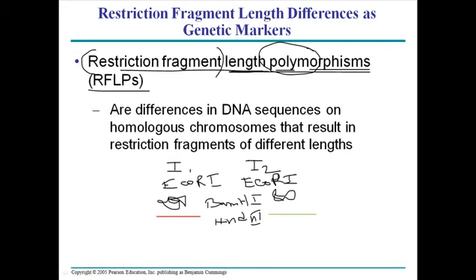After using this enzyme to cut their DNA, what we find in individual 2 is that the length is like that. We end up with 4 different segments. How can we know we end up with 4 different segments? Well, by running gel electrophoresis. So we call them the restriction fragments now. We use the blotting technique to identify those genes. So we finally find what we call a restriction fragment, or we finally find a blot. We will do blotting later, but now let's think about individual 1.